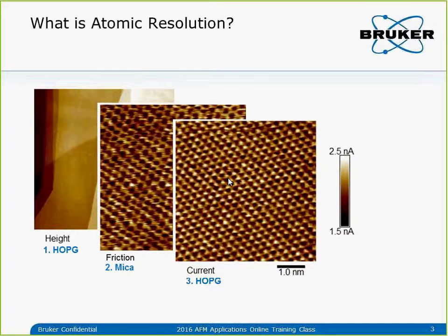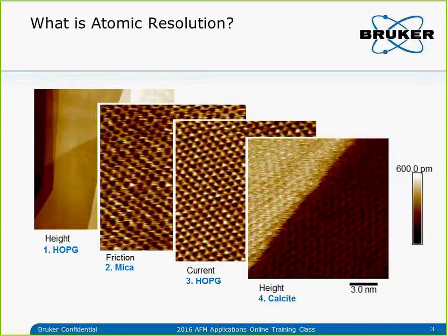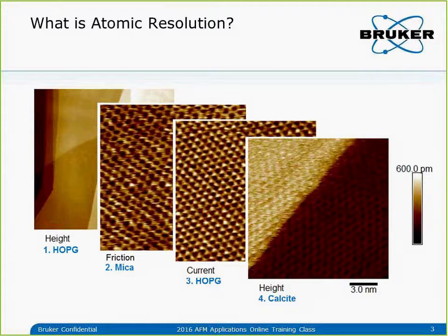The next example is HOPG with STM. You can see the lattice, and in STM we actually use a single atom to image individual lattice sites. This is true atomic resolution. The last one is calcite imaged in fluid with peak force tapping mode. The lattice spacing is about 5 or 7.5 angstroms depending on direction. The big difference compared to the previous two examples is that we can also see a single atomic step of the calcite in fluid as well as the atomic-scale lattice on each surface. We call this true atomic resolution.